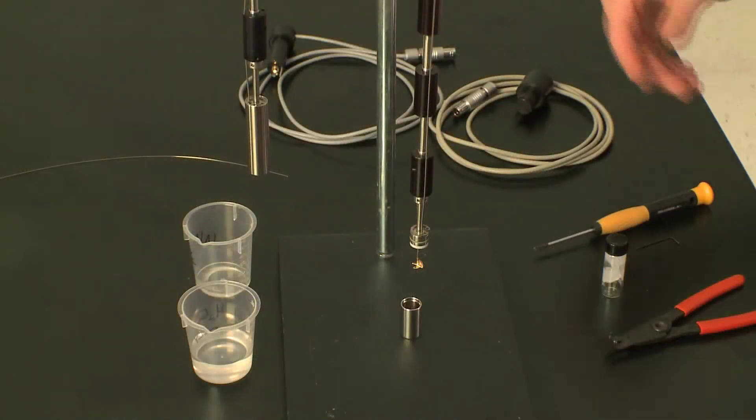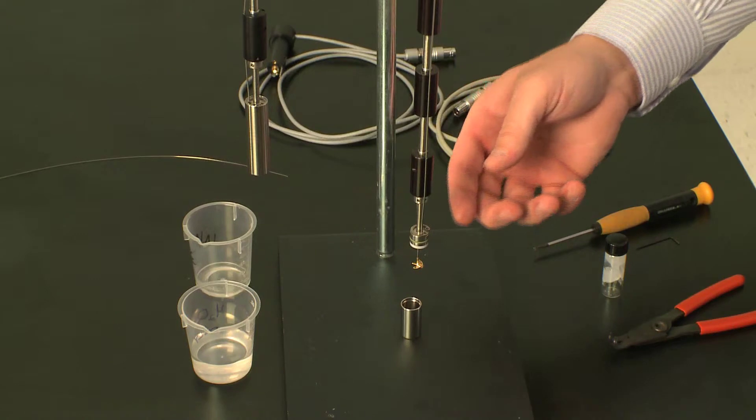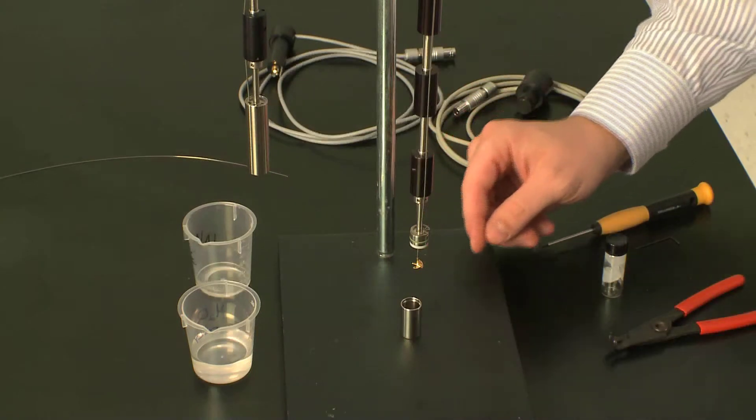In this TA Tech Tip, we're going to be preparing the ITC ampule for an experiment for the TAM calorimeter. The first part of preparing the ITC ampule for an ITC experiment in the TAM is to adjust your stirrer height.